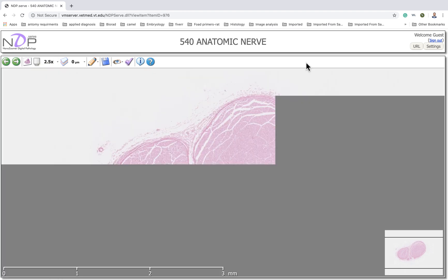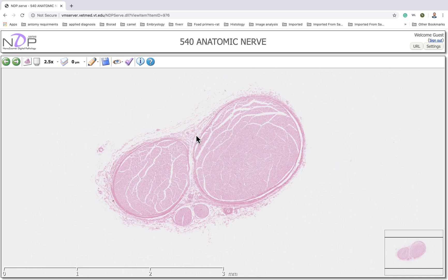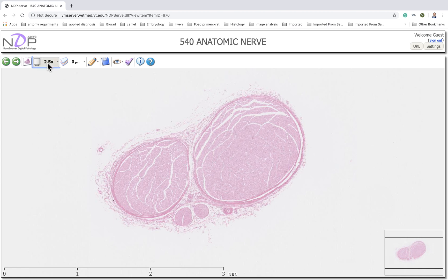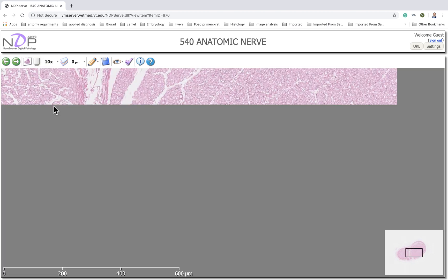If we increase the magnification, we can see these bundles and the connective tissue — this is the perineurium. The space here is the perineural space. As stated before, this space will be filled with the cerebrospinal fluid.